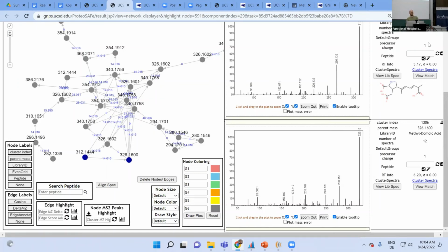Okay, another question? So again, in this case, I have 2 domoic acids and 3 methyl domoic acids. Is that okay? That could actually be the case, because there are a couple of regioisomers of domoic acid. So I would not be surprised if there were multiple chromatographic peaks, but it rings a little bit of a bell.